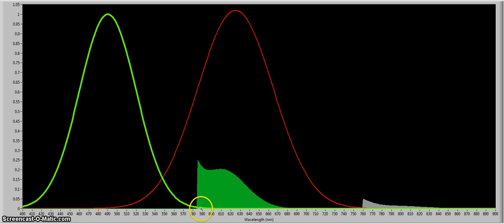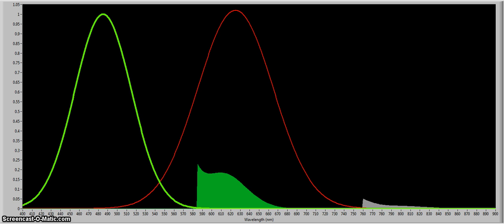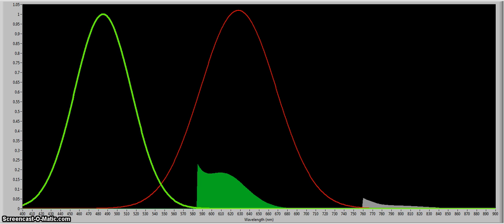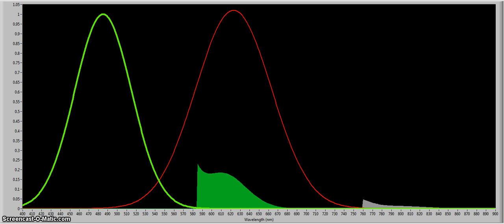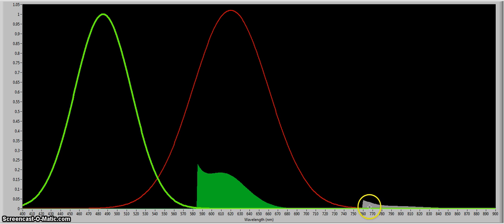However, we also get a significantly larger amount of crosstalk, which needed to be understood and addressed. When we do the same thing for the red channel, we see as we go farther to the red, likewise we get an increase in the overall value of our fluorescence. But once again, we get creepage from the crosstalk from that. And if we move it to the left, the signal goes down, but the crosstalk is reduced substantially.